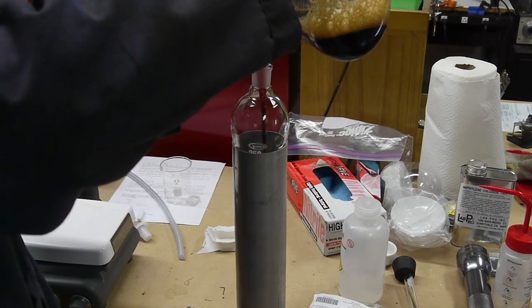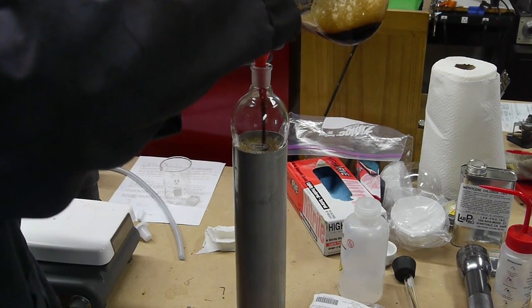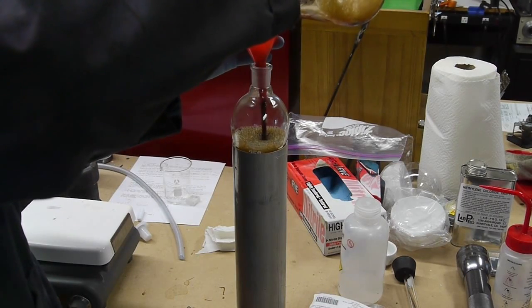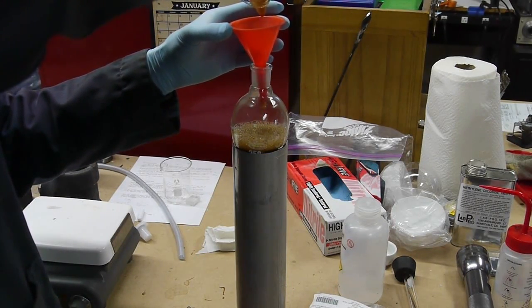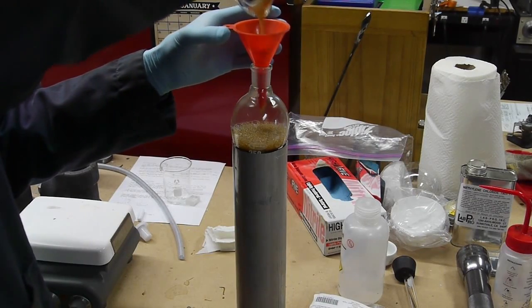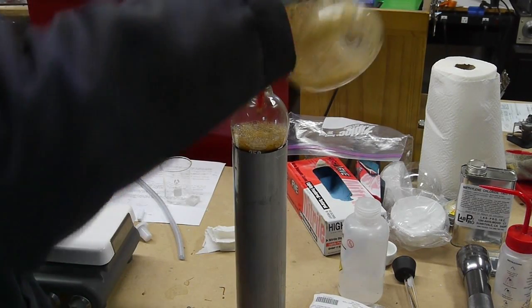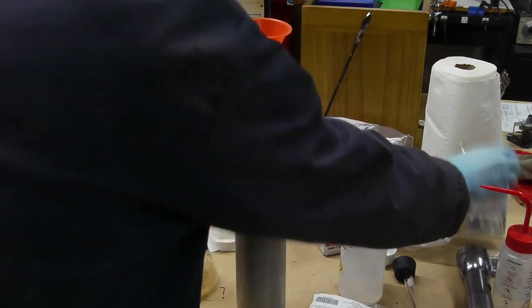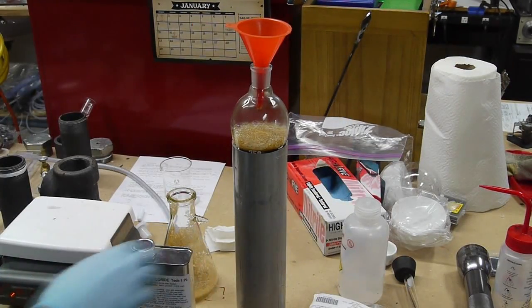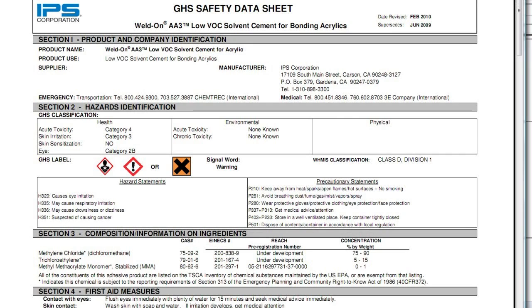So the accepted method of doing this is to mix the caffeinated water - the aqueous solution - with a hydrocarbon solvent. And one popular solvent is methylene chloride. So this is the active ingredient in paint stripper, aggressive old-fashioned paint strippers, and it's also the ingredient in acrylic cement.